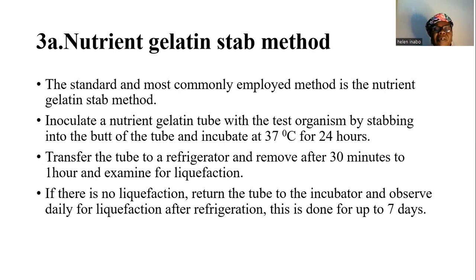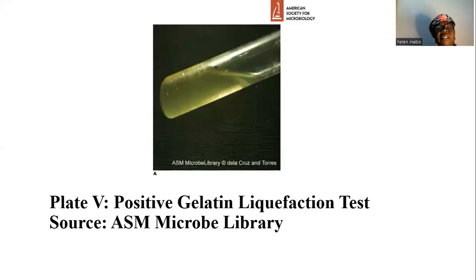If there is no liquefaction, the tube should be returned to the incubator for another 24 hours and observed daily for liquefaction after refrigeration. This is done for up to 7 days. Here is a plate showing the positive gelatin liquefaction test.